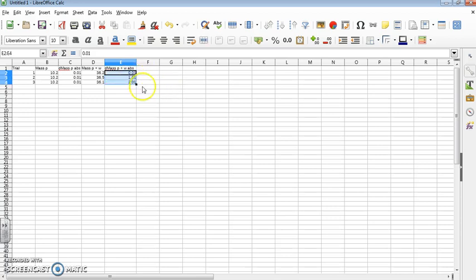So, oops. Okay, so this might happen, and if that does happen, we can do this instead. I can do equals 0.01, and then if I fill down, it won't automatically add 1 to each cell. So that reminds me of another thing about using a spreadsheet. Make sure you look at what's going on. It's very easy to quickly type stuff in and think, oh, I can trust those numbers, but you want to make sure that you really know what's going on top of that.